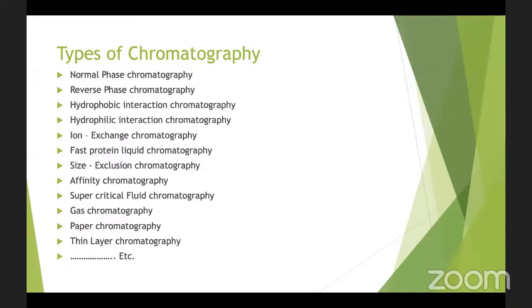Then hydrophobic interaction chromatography, where the separation is on the basis of hydrophobic interaction between the stationary phase and the sample to be isolated. Then hydrophilic interaction chromatography is based on hydrophilic interactions. Hydrophobic is basically water hating. Hydro is water and phobic is hating. Similarly, hydrophilic: hydro is water and philic is loving. So basically water loving.